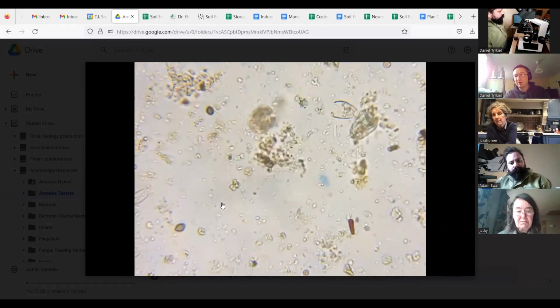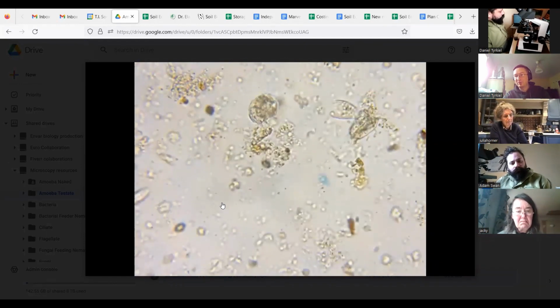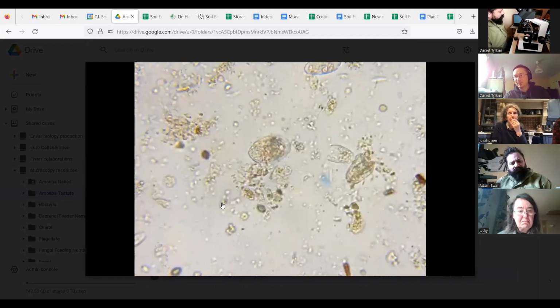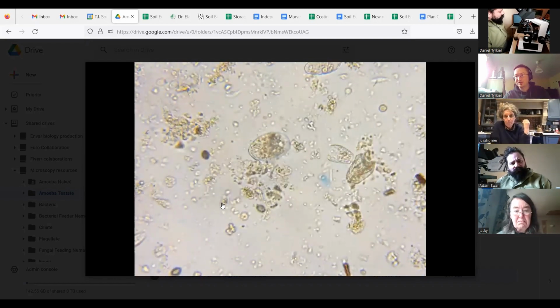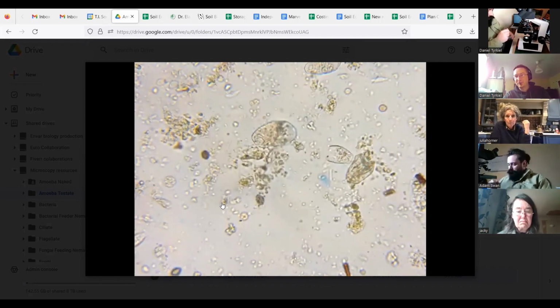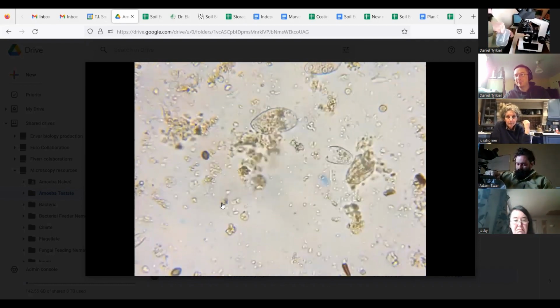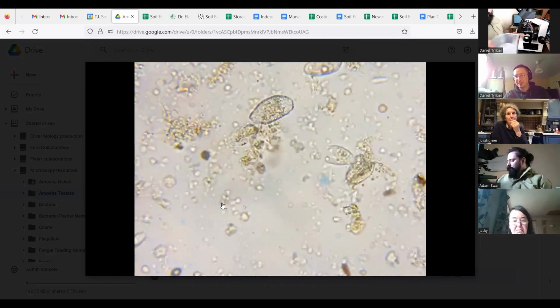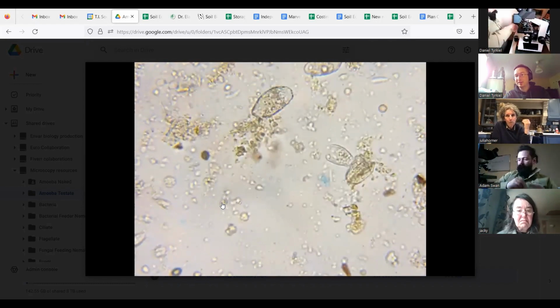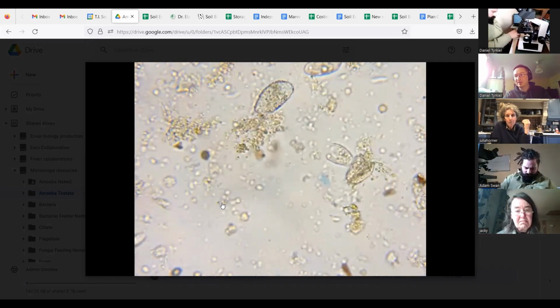If you wanted to start on the cheap, first of all, you can go on YouTube and find old videos of Dr. Ingham showing how to prepare a sample. You can also go on Facebook and sign up to groups for soil microscopy, for soil food web microscopy. A very good group is also fungal microscopy. Oftentimes, if I don't know what I'm looking at, I will send them a picture of the mushroom and of the spores, and they will tell me exactly what species that is. So there are many free resources online to start your journey without spending too much money.